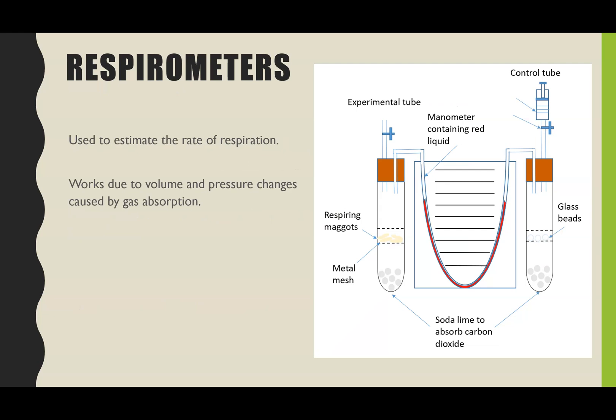So we're going to be looking at the use of a respirometer today. We're going to go through all of the pieces of equipment here, the purpose of each and then what we'll be measuring and it's all to do with changes in volume and therefore changes in pressure caused by gases absorbed by whatever living organism is placed inside of this experimental tube.